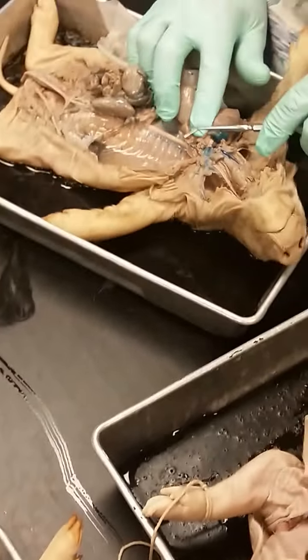The other thing that you may see, and it depends on the pig, you should be able to see lobules. You see that kind of fractured look on the surface? If you look closely, you can see it. Those are lobules. They're not always hexagonal, but they're angular in shape. So you can actually see them.